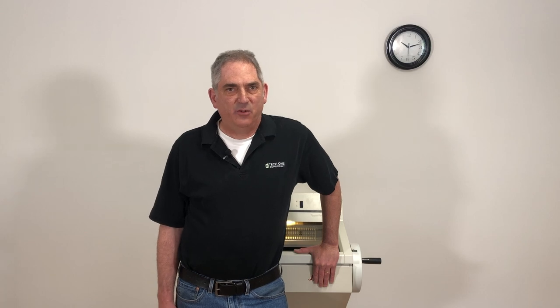Hey guys, one question we get asked quite a bit, particularly from smaller labs and doctor's offices, is should I turn my cryostat off to save electricity? No, the answer is no.